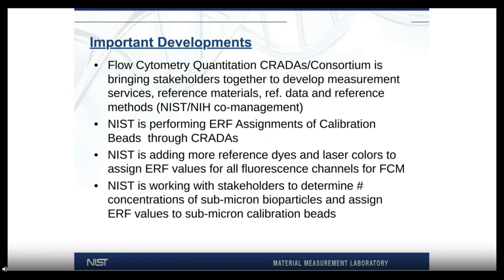So the important developments here are that flow cytometry quantitation, the consortium, and the CRADAs that we've developed bring stakeholders together to develop measurement services, reference materials, reference data, and reference methods. And this is a NIST and NIH co-managed consortium. I should also mention that the Flow Cytometry Quantitation Consortium has recently been replaced by the Flow Cytometry Standards Consortium, where we're expanding the scope of the consortium beyond ERF measurements.